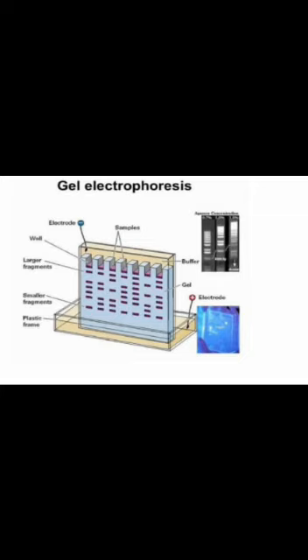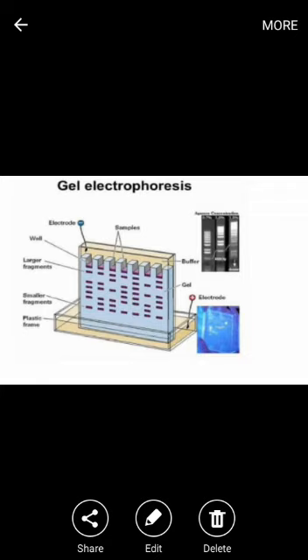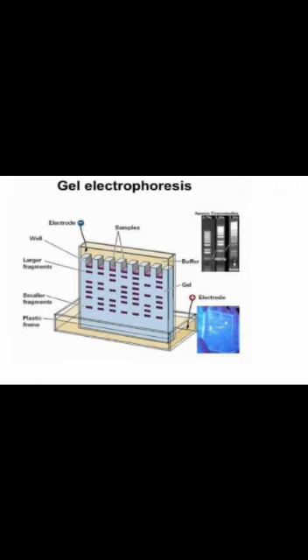and be separated. Finally, after the DNA, RNA, or protein molecules have been separated using gel electrophoresis, bands representing the molecules of different size can be detected.